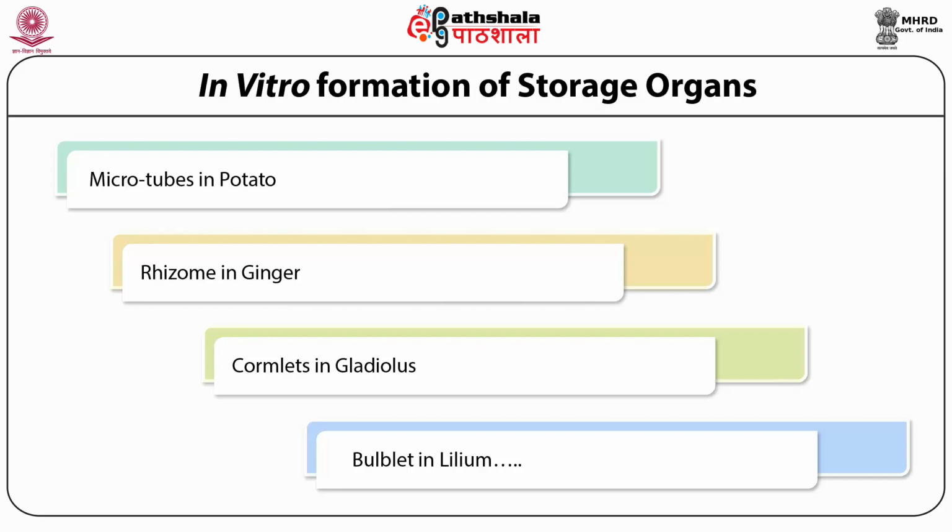The technology developed today is that the plants are developed by tissue culture, and thereafter we take them into hydroponic culture. From each plant, you can get a large number of microtubers, and microtubers are continuously harvested at the 8 mm stage. Practically everyone who is into the potato business has set up tissue culture as well as hydroponic facilities for large scale production of microtubers.